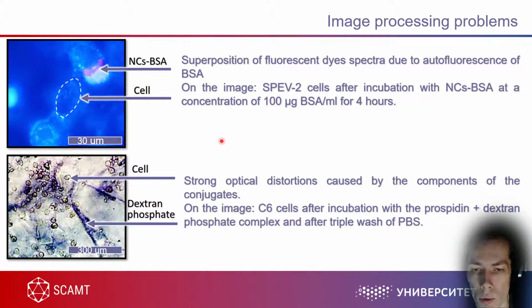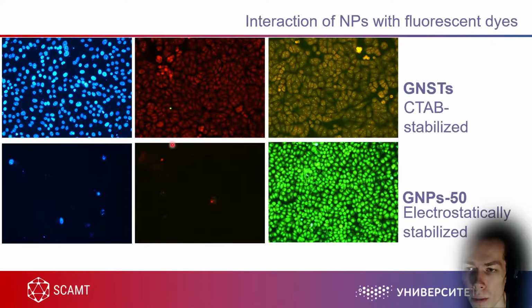It's again going back to the first questions on the first slide in fluorescence. In fluorescence, I asked you what should be the quality of your sample. If you have some gel, if you have some other additions in your cells, it would be very hard to obtain a very good-looking sample. So to obtain images even like this one, very clear, where every organelle can be observed, this is just a very low magnification, so everything is clearly seen.